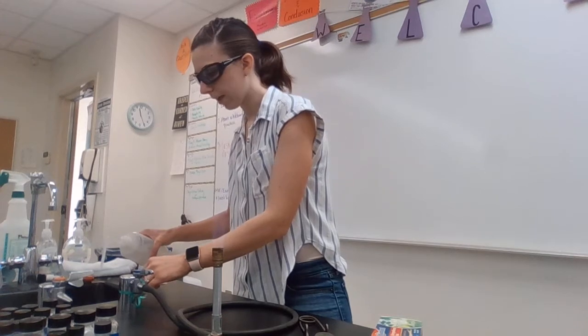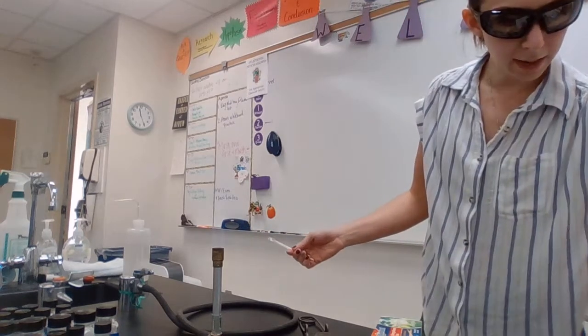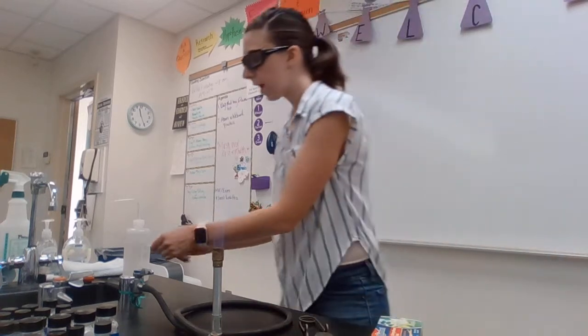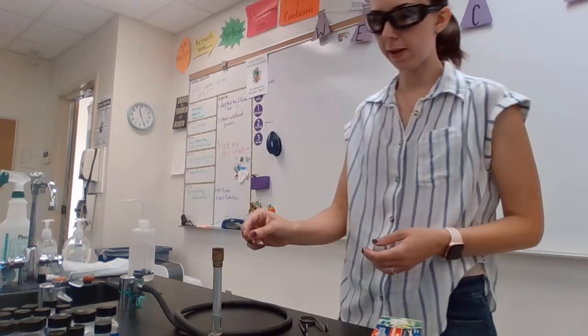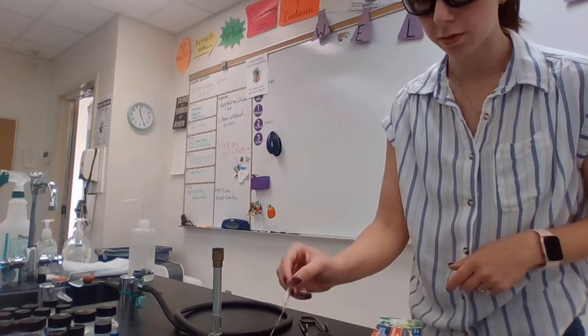So looking at your lab, seeing what that might be. Some things that come out as red, lithium can show up as red, and so can strontium. Those are two things off of our chart that show up as red. So make sure we're all clean, nice, no color, so there's nothing left on there. We're going to try medicine bottle number 2.